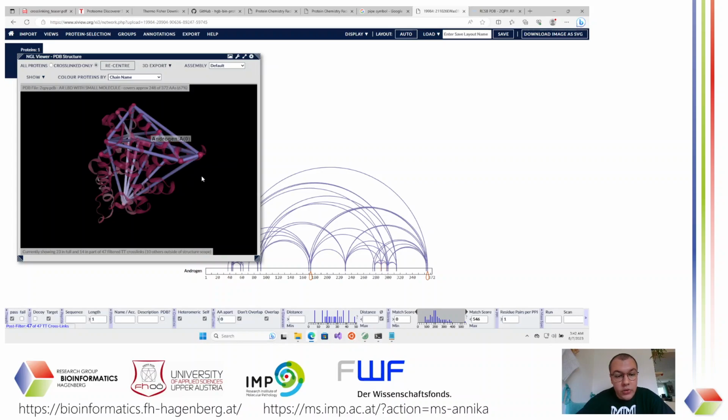You can also get something like this, of course, in PyMol and in ChimeraX, with some additional coloring options, where you can color the crosslinks depending on the length of the crosslink, which is usually very helpful to see immediately which of these crosslinks are plausible and which of them are not. Unfortunately, I have not found out if that is also possible in xiVIEW, but it's definitely something you can do in both PyMol and ChimeraX, which we also have exporters to.